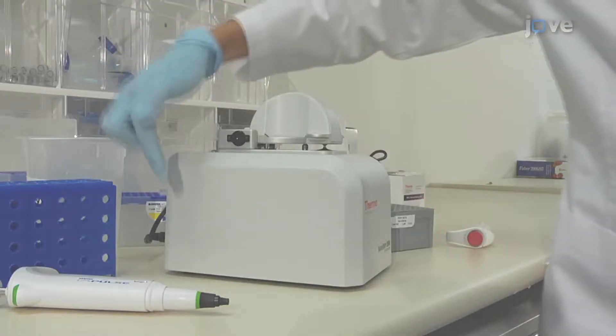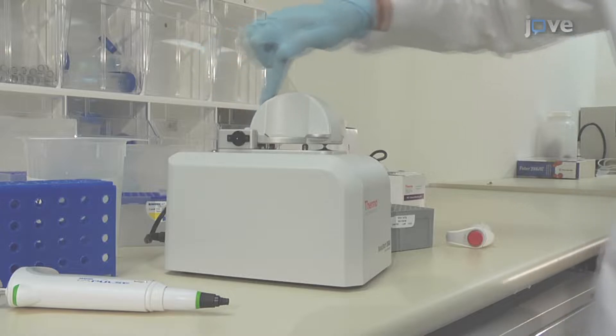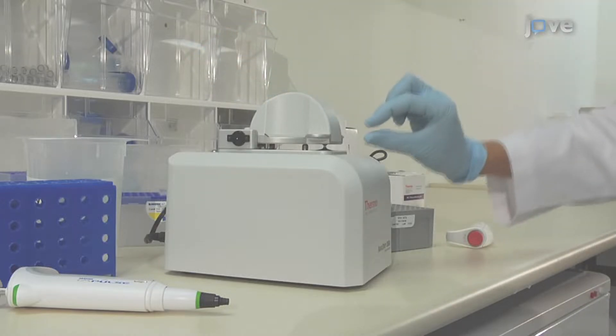A xenon flash lamp provides the light source, and a spectrometer utilizing a linear CCD array is used to analyze the light that passes through the sample.